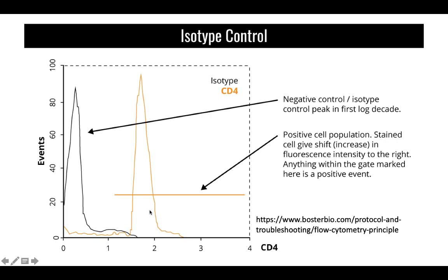There are different applications, but what we are trying to do is compare if a certain protein is present or not, and the results are usually represented in this format, where it's the isotype, the one which is the negative control, and the positive control. So this basically means that protein X is present here, and the negative control is here. This is where we just put in the secondary antibody, and this is where we put in the primary plus the secondary. So that's what the result is.